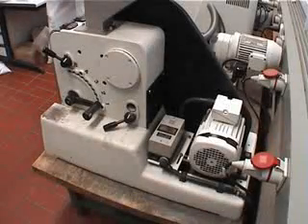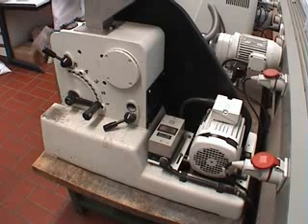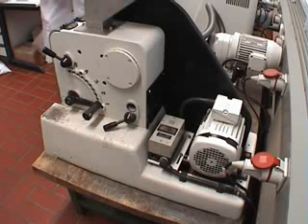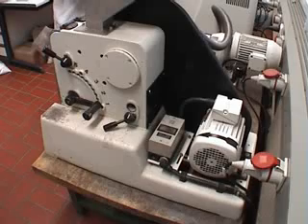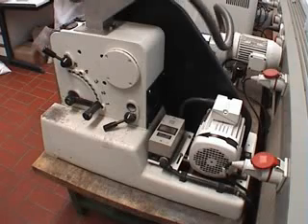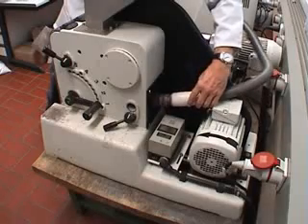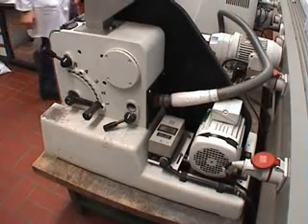To avoid exposure of too much dust while milling, the Pulver Z1 has the possibility to add a vacuum cleaner — an exhaust system — to the instrument to protect the environment against dust. This is the place where the vacuum cleaner is connected to the unit.